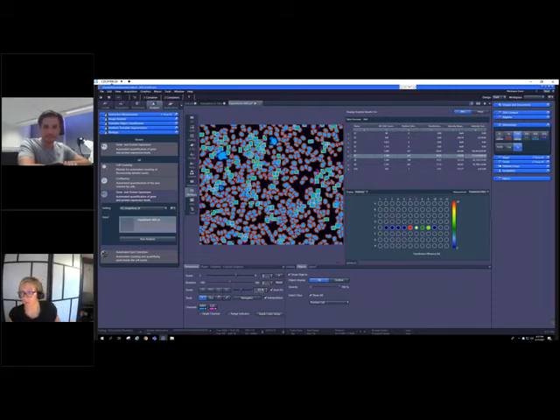Thanks, Frank. So the bio apps look really powerful and easy to use. I love streamlining what would ordinarily be a complex image analysis, including artificial intelligence, into a simple, easy to use app. It looked like you just literally clicked one button and then you got this great analysis, including a heat map display very quickly. So again, thanks for showing us both those examples.